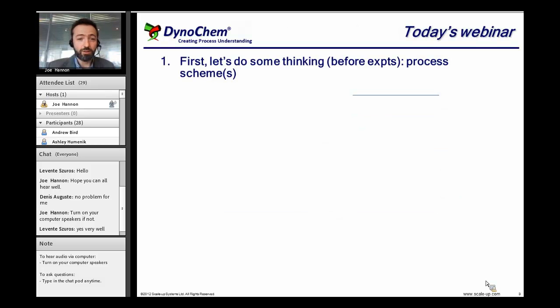In today's meeting, I'm going to start with that perspective. I'm going to say, let's first of all do some thinking about this problem we're going to work on eventually with Easymax and in the pilot plant. And let's do all that before wetting any glassware or using any material or developing any sophisticated measurement techniques, or even taking any samples.